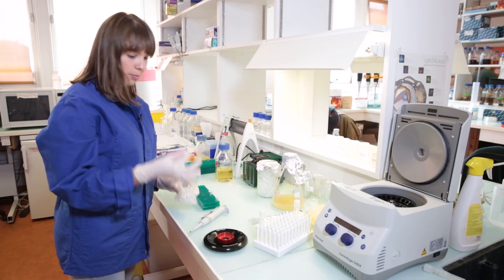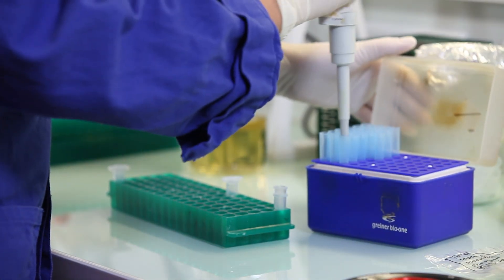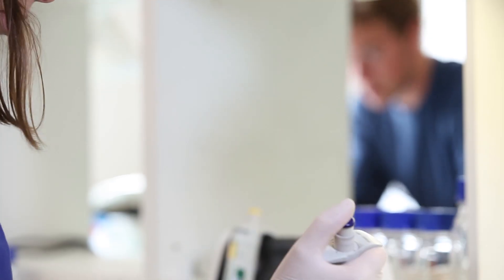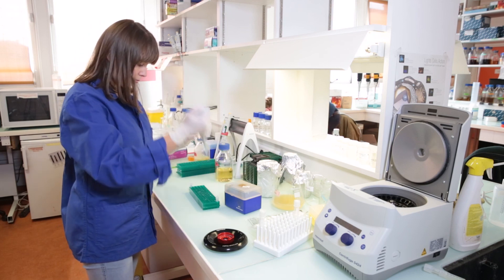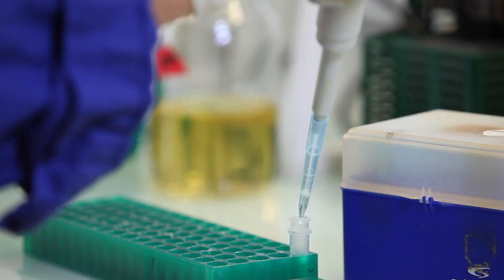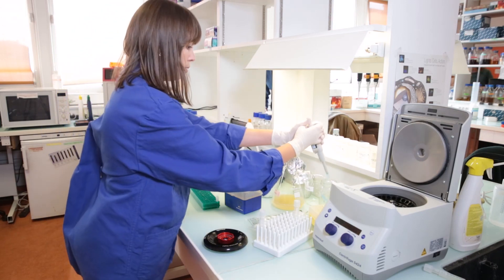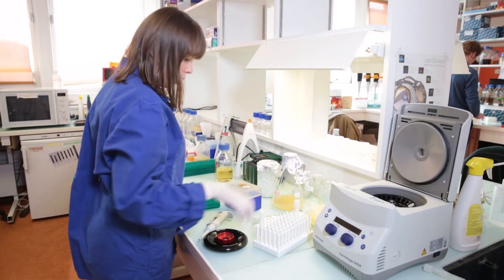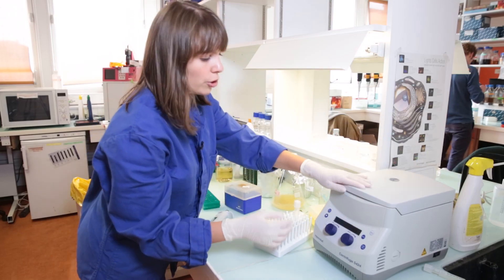And now we are going to proceed with the next step. For this we will need a collection tube and a filter column, which are usually provided with a kit. We will have to pour the supernatant on top of the column. The supernatant now contains our plasmid in the solution. You can now discard the pellet and proceed with the column. We will now centrifuge the column one minute at maximum speed to let the solution flow through the filter.